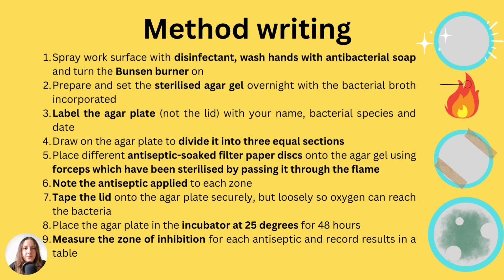So let's go through the method. The first thing you want to do is spray the work surface that you're going to be using with a disinfectant and wash your hands with an antibacterial soap and turn the Bunsen burner on.